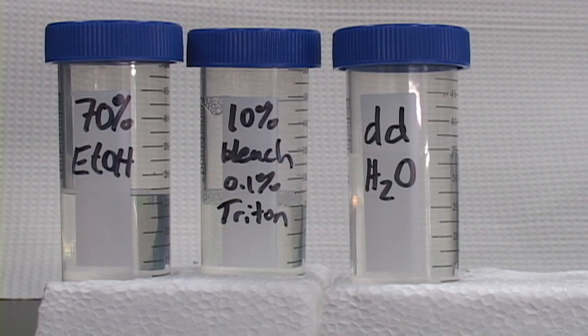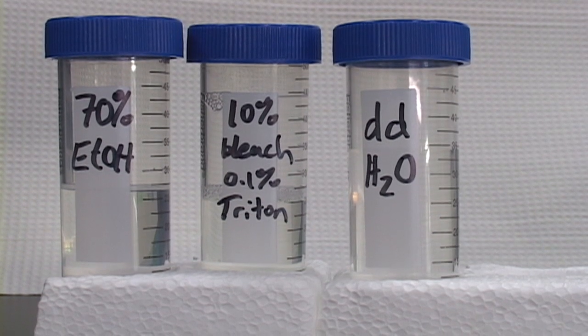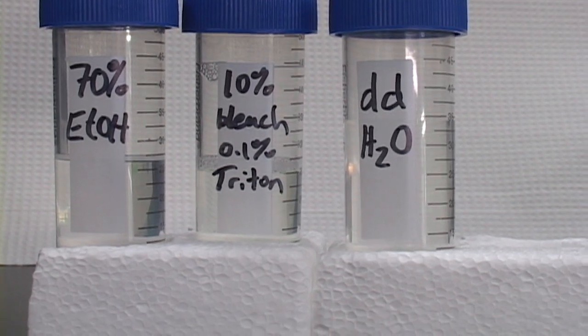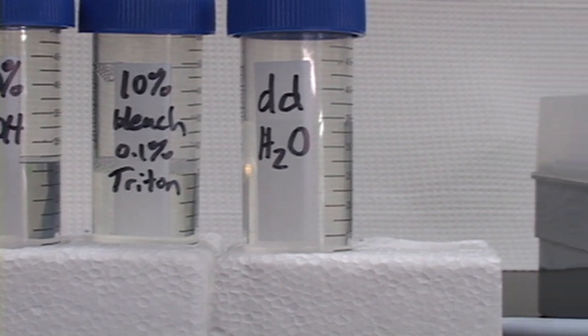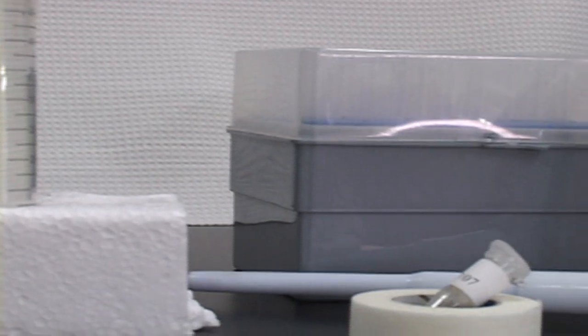The reagents you will use to sterilize the seeds are 70% ethanol and a solution of 10% bleach with 0.1% of the detergent Triton X100. Finally, the seeds will be rinsed four times with sterile water.